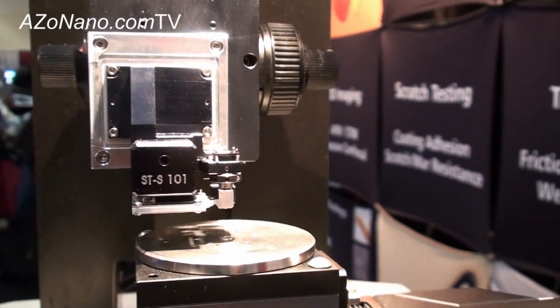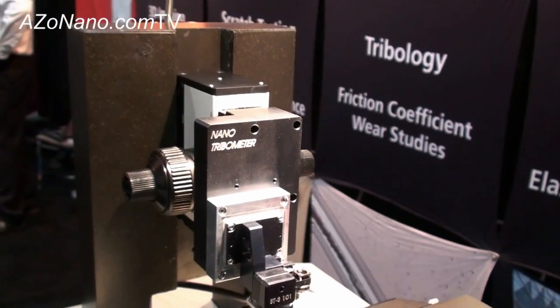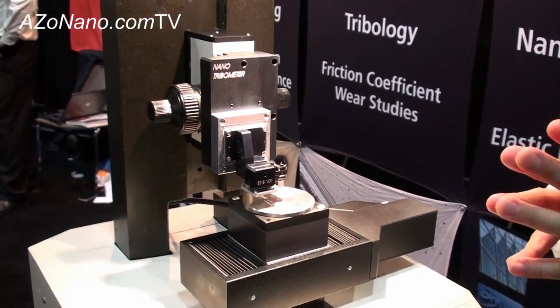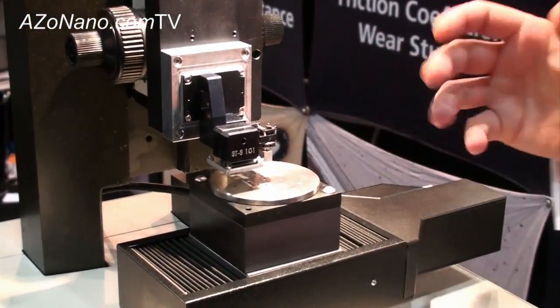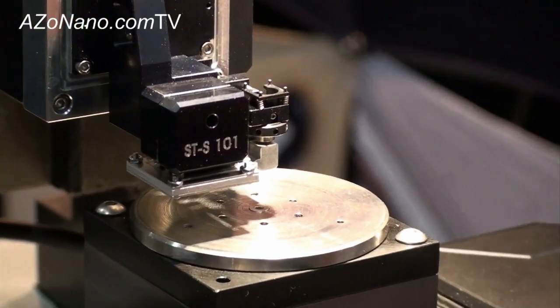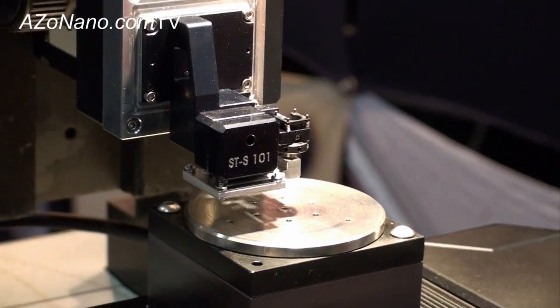Most people doing tribology at the nanoscale may be using AFM technology. This uses a similar load range to the AFM but allows you to put whatever contact geometry you want on the system. The disadvantage of an AFM is you don't know the geometry of the tip. With a system like this you can choose the exact shape and size of the static partner that will be doing the testing.